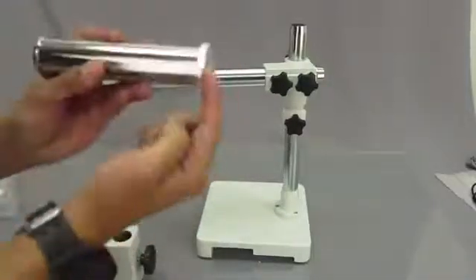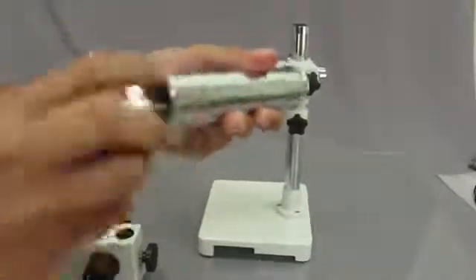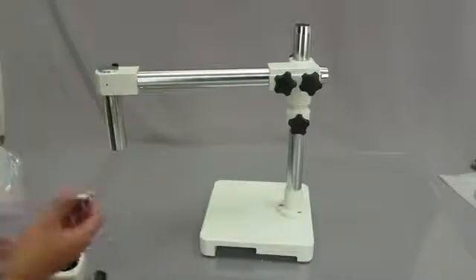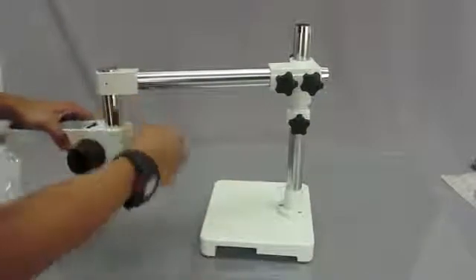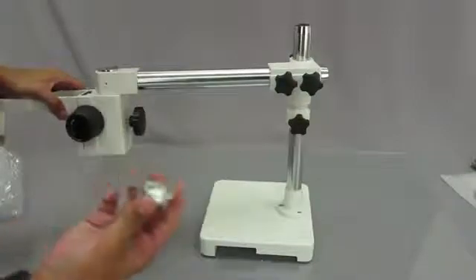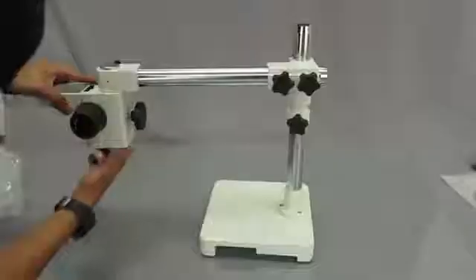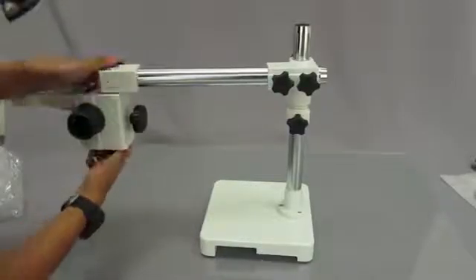So what you're going to have to do is unscrew the bottom part. Just unscrew the bottom. So you see the ridges are gone now. All you have to do is drop this in right there. And then put the focusing rack on. Put it up. You might have to make sure this is unscrewed a bit before you put it up. And then get the cap and screw it back in on the bottom. Make sure you put it tight so that it doesn't get loose or fall out.